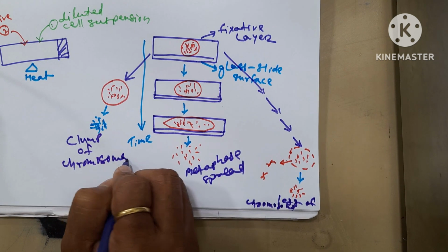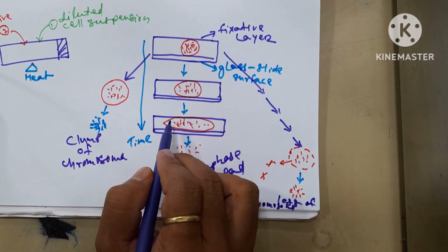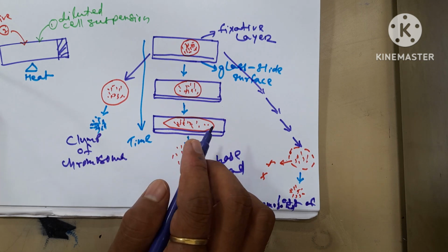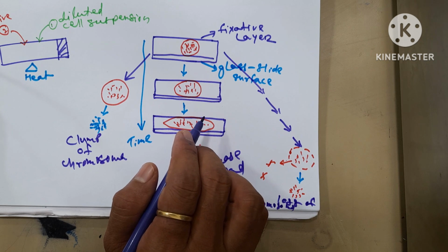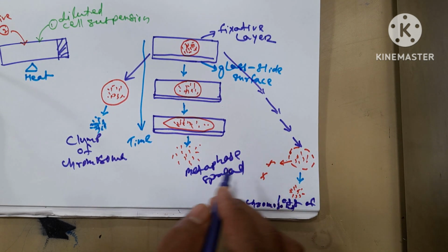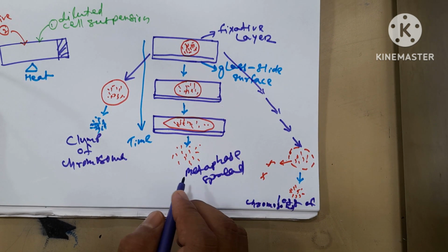So we have to standardize the evaporation time, and there is no fixed timing for how much time we have to give. It depends, it needs to be standardized from lab to lab. So this is the mechanism behind getting a good metaphase spread. Thank you.